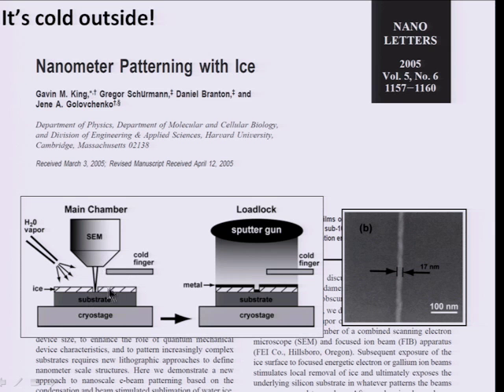Another point here is that the interaction between these beams and materials can also change the situation and can be used for some aspects of fabrication. And this would be an example of what I'd call a top-down fabrication, taking something existing and cutting it into pieces. And if, for example, you could then create the line using this technique and maybe assemble some nanostructures along that line, that would be a combination of a top-down and a bottom-up technique. And we'll build upon that idea as we move on.